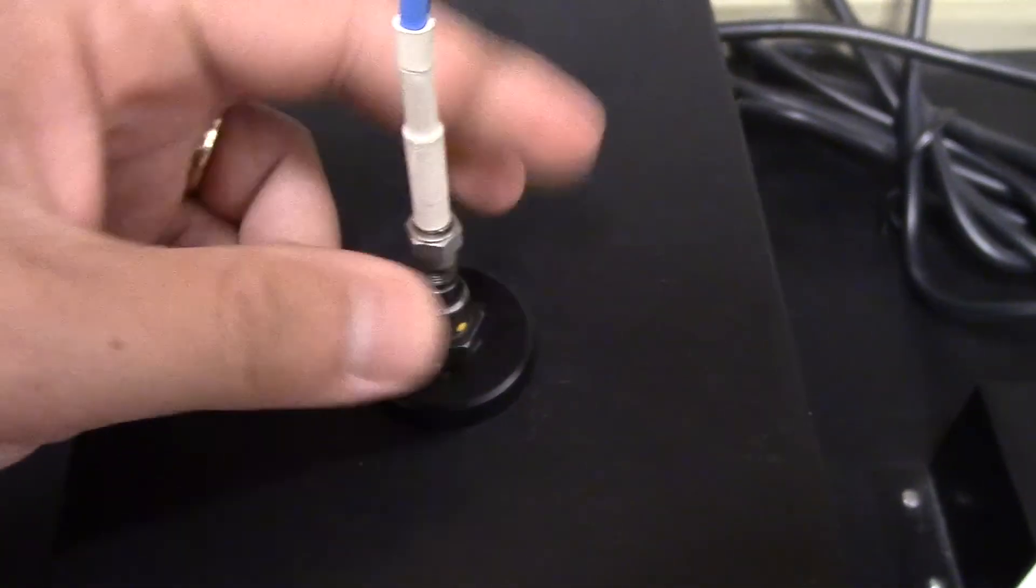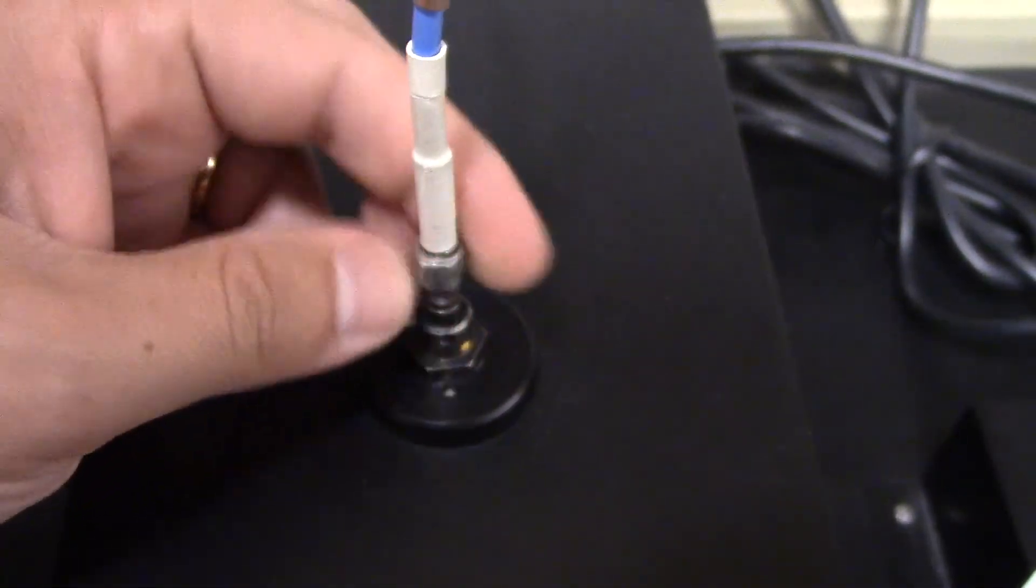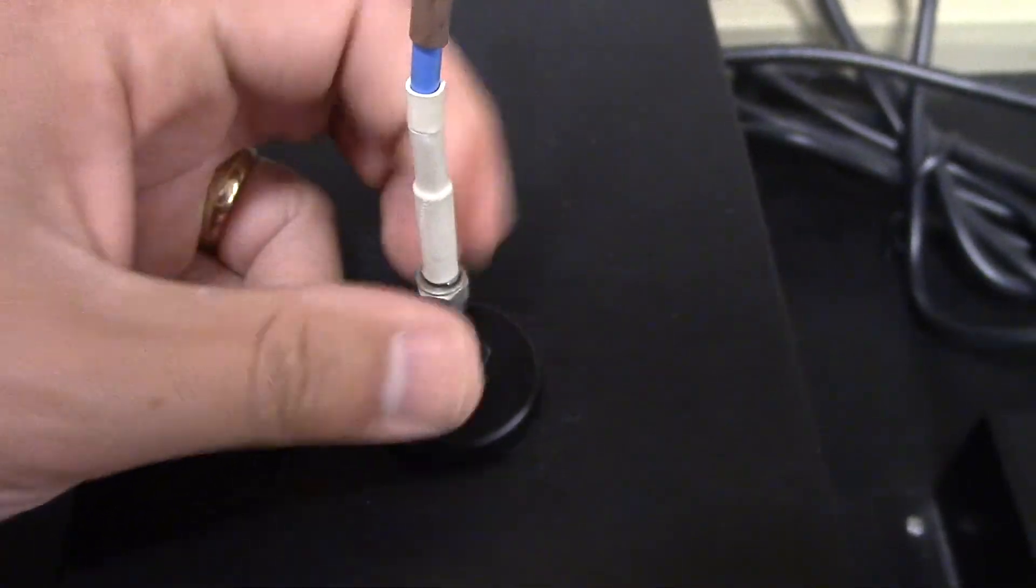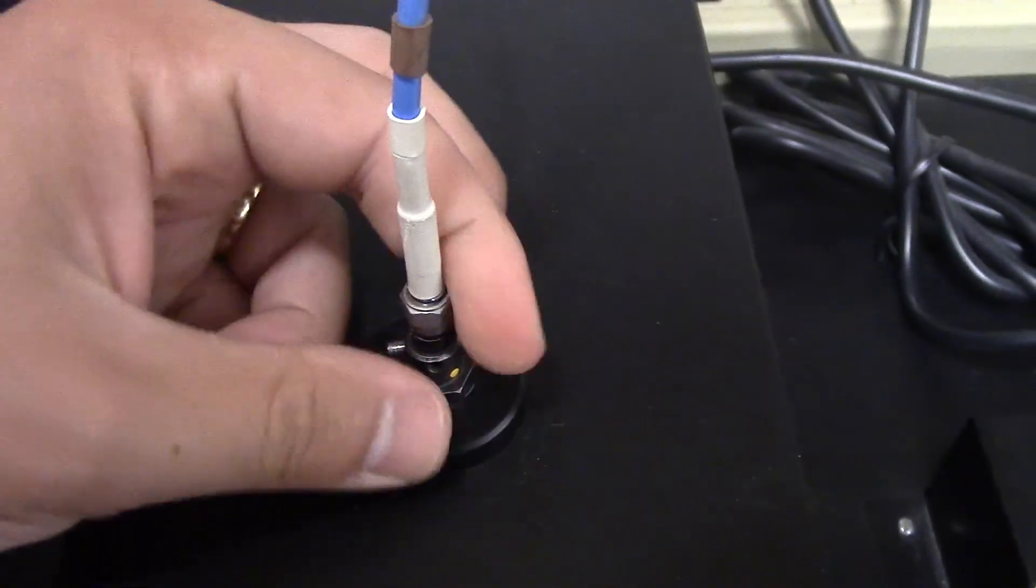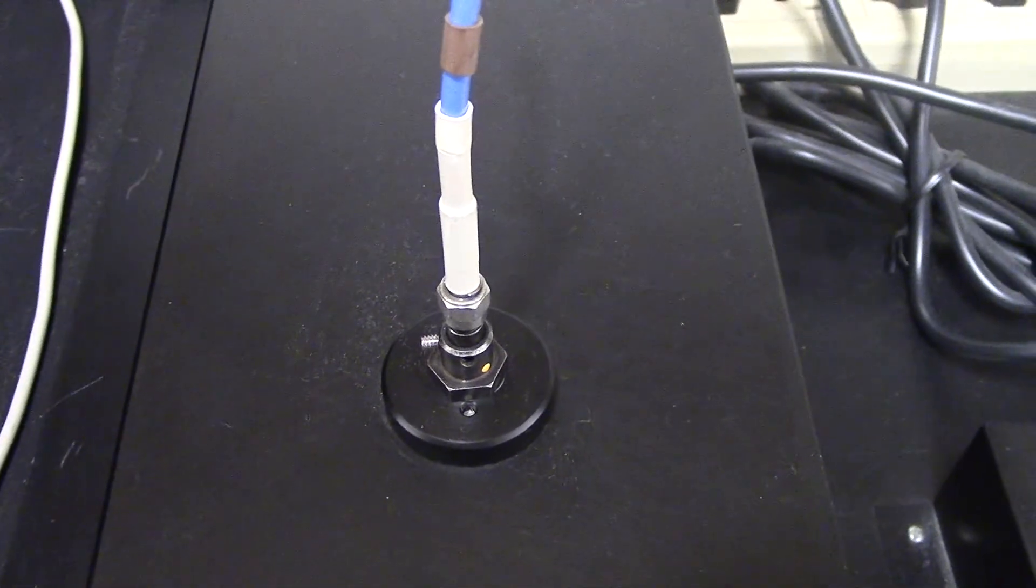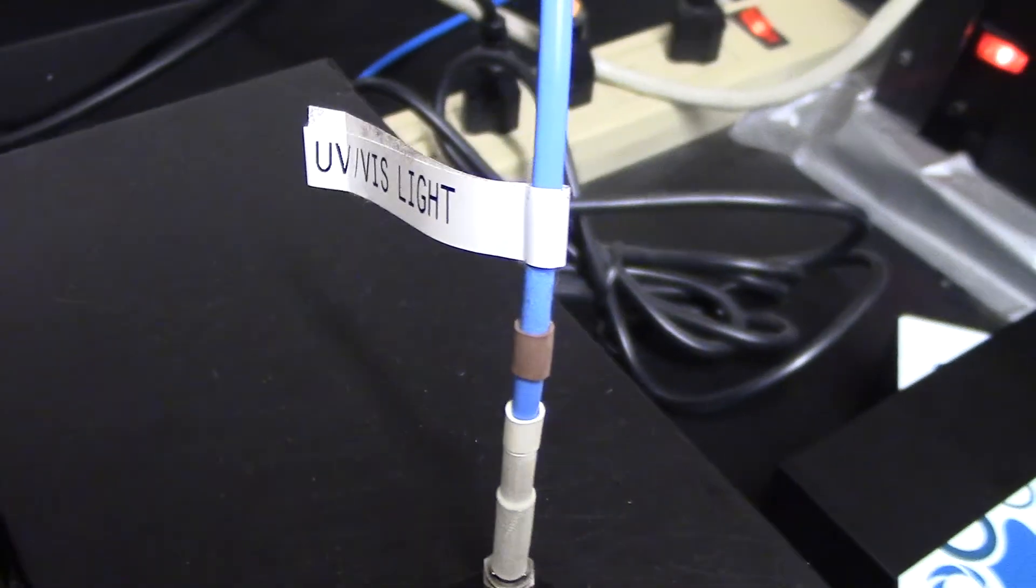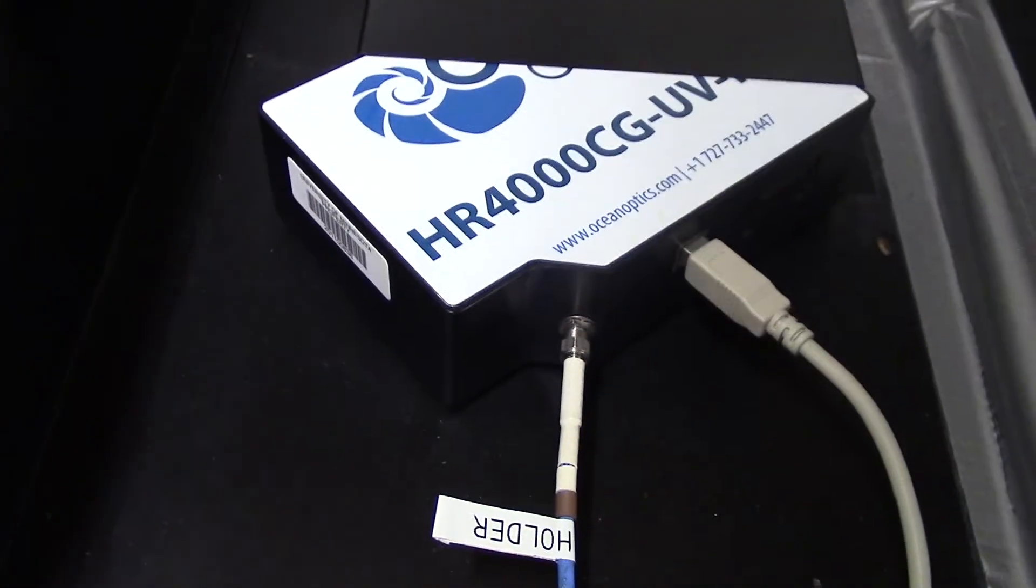Here you can see how this experiment actually works. You begin by connecting a fiber optic cable to the emission lamps. This cable passes light from the lamp, along the length of the cable, to the ocean optic spectrometer, where it's analyzed.